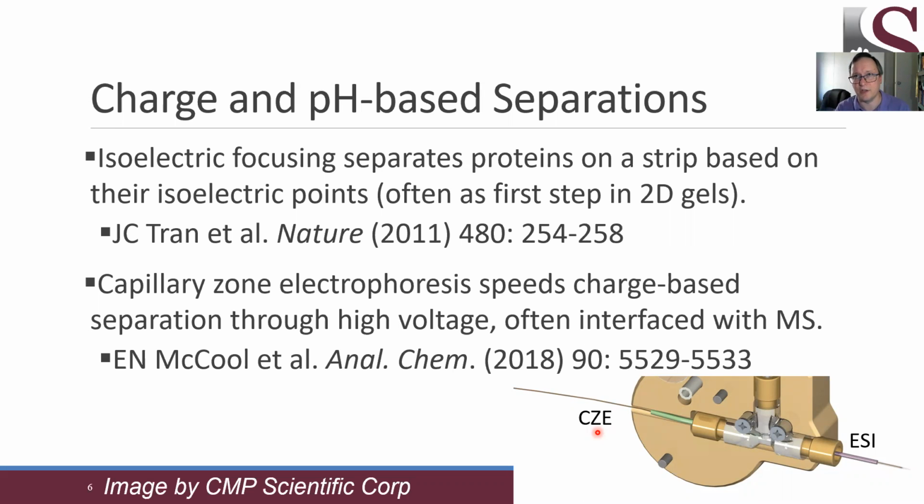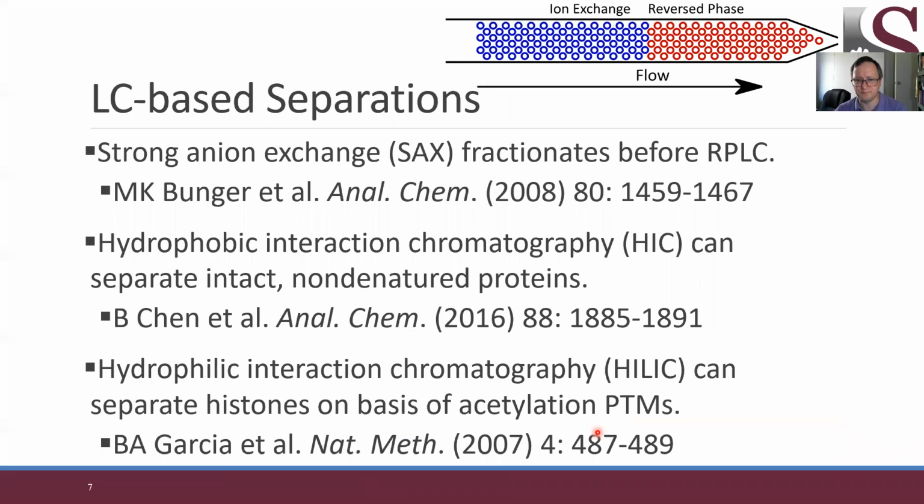their charge essentially. So the pH at which you're running it is going to determine what charge states individual proteins take on, and you can do a separation really quickly with a huge number of plates of separation, so very clean separations among different proteins. The trouble is that capillary zone electrophoresis doesn't let you pack a huge load of protein onto the column, and that's been something that we've struggled with for a long time. But we see that in top-down, it's made its reappearance and can be a very valuable replacement for liquid chromatography.